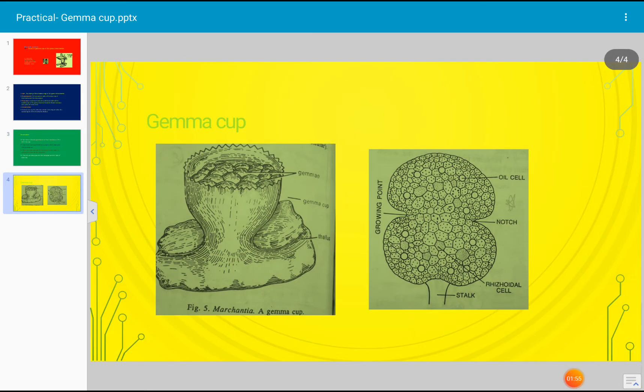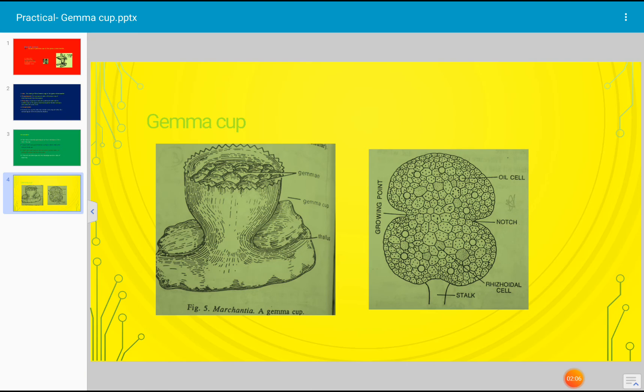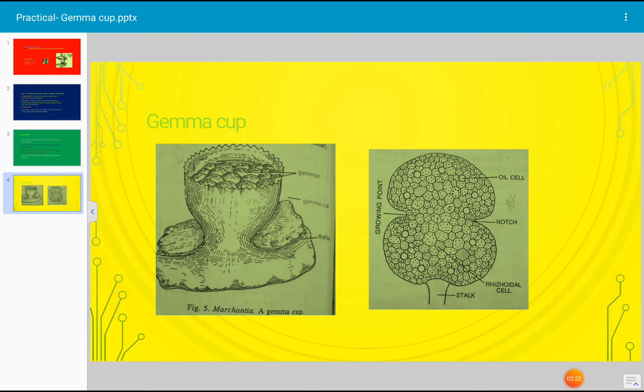Next, this is the photograph. To the left side is a gemma cup, and at the basal region thallus is shown. To the right side, a single gemma is shown. See the stalk-like structure - stalk is there to the gemma - and rhizoidal cells are there in which chlorophyll is absent. The notch is shown in the photograph, and oil cells are also shown in the gemma.